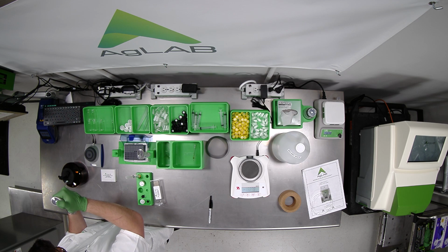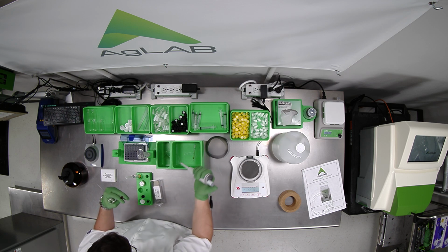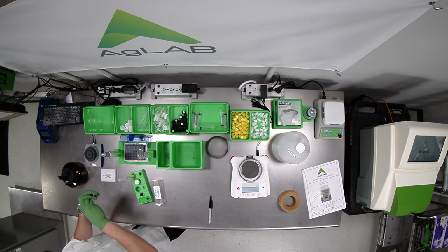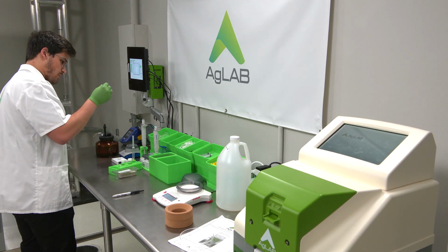Same thing, tip just into solution and going to depress to push the solution out and up to pull more solvent into the tip. And I want to do that 3 times to rinse. You want to make sure that you get all of your D1 solution into D2. That's the reason that we rinse here, because a transfer that's not as precise for this step will be more likely to hurt your results. This is the most important transfer, most important step in the procedure. So take your time, be careful, and make sure that all 10 microliters make it into your D2 vial.